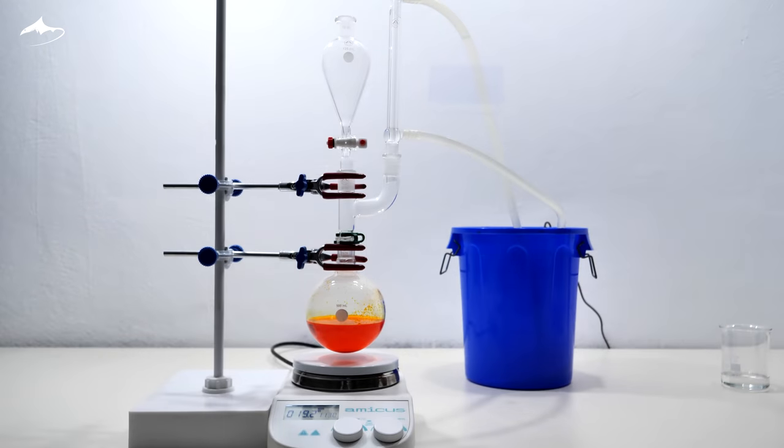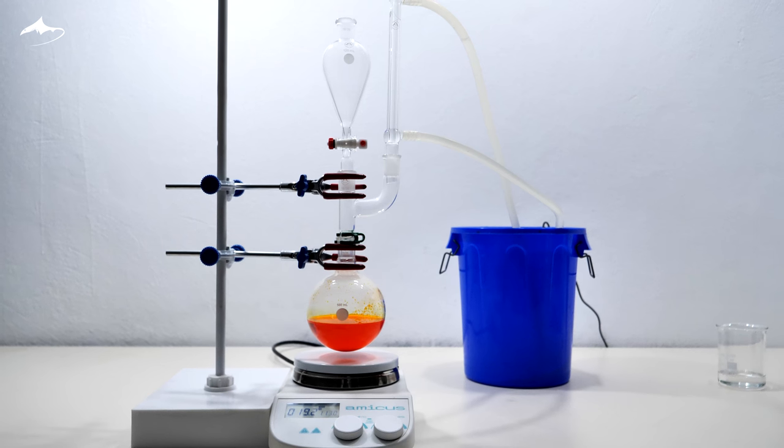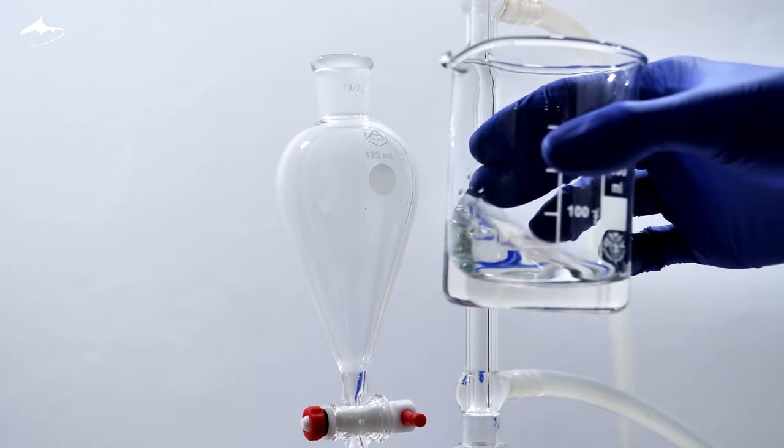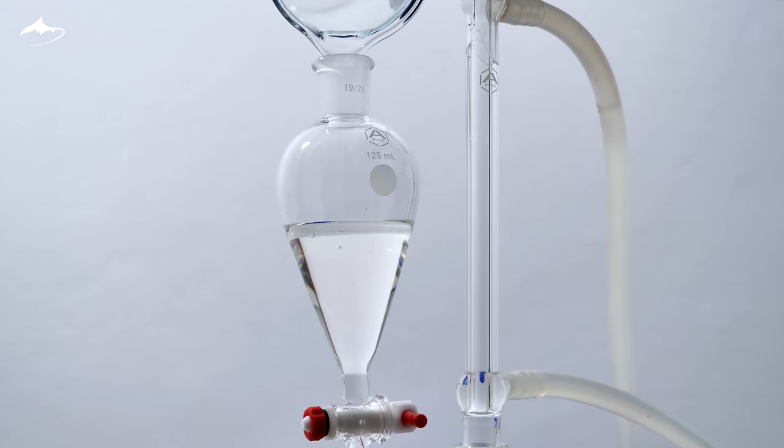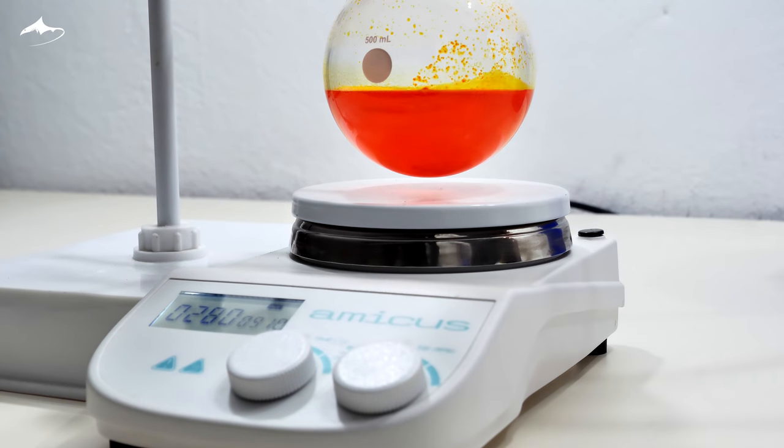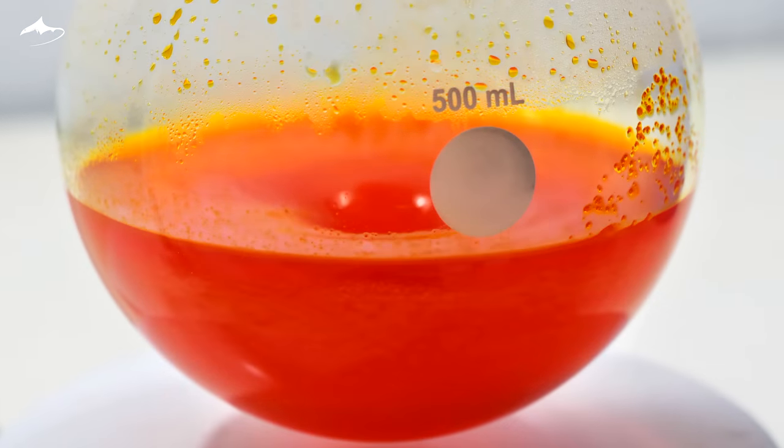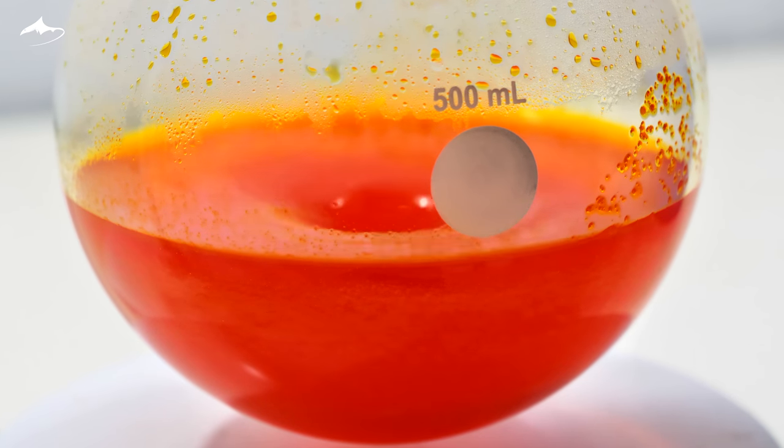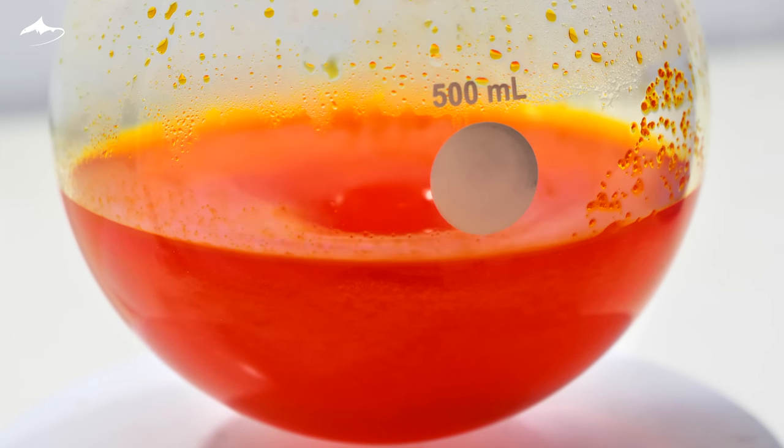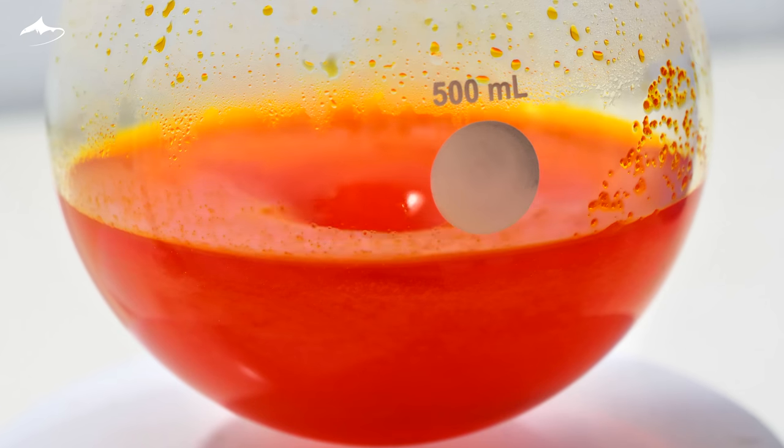This is the apparatus I set up for the reaction. The reducing solution is placed on the dropping funnel, and the stirring is turned on. Since the reaction is exothermic, heating is not needed. The reflux condenser prevents any loss of reaction volume by evaporation.